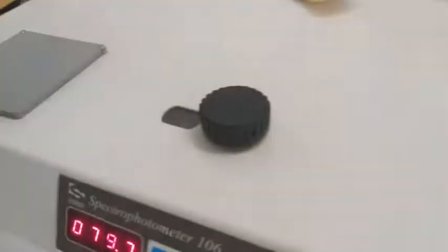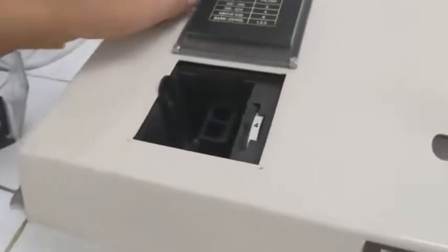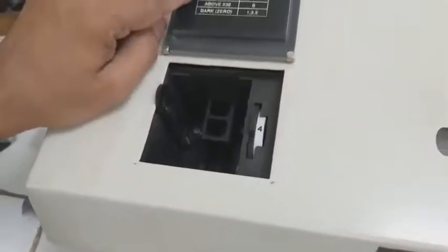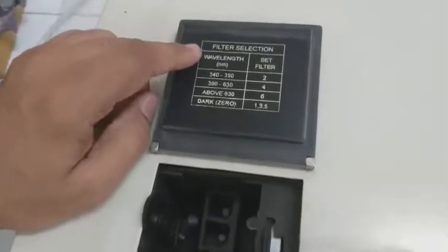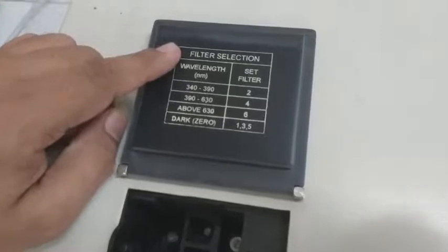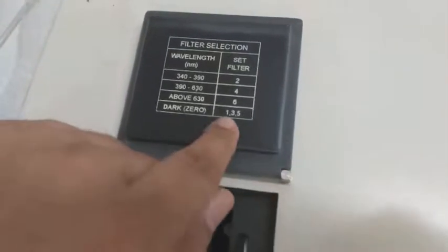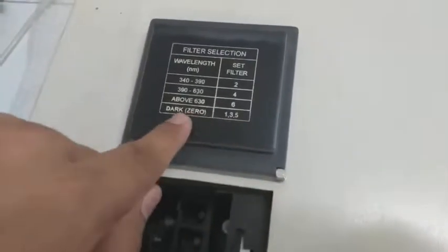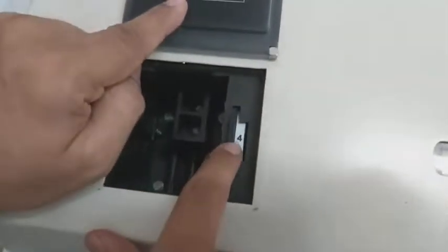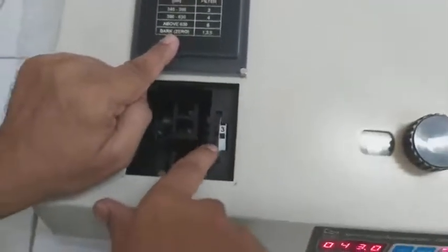This spectrophotometer has a wavelength knob. Here is the lid for the sample compartment chamber, or cuvette chamber. This display shows information for the filter selection: filter number one, three, five — these are filters for dark. This filter number is shown here; this is the rotating filter wheel.